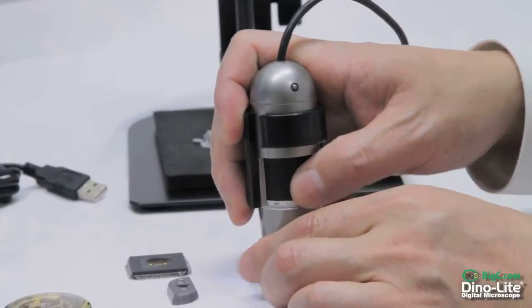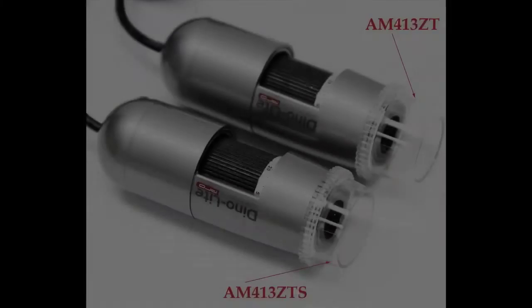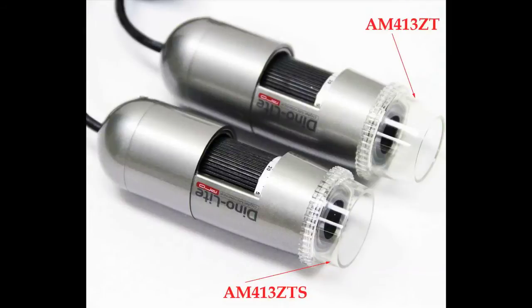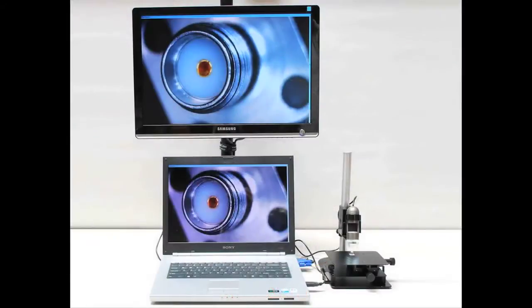This is great when inspecting an item that is recessed from the surface plane, maybe behind glass, in plastic, or behind a protective film.